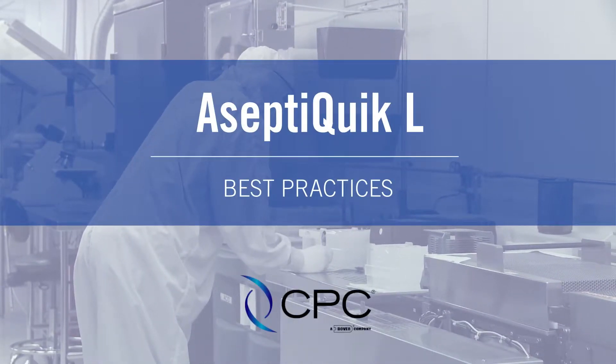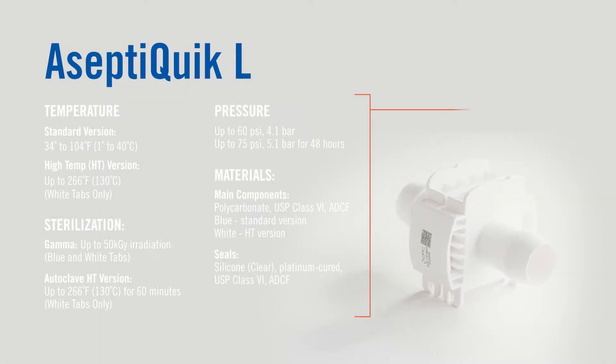Welcome to CPC's AseptiQuik L Best Practices Assembly Recommendations video. Maintaining sterility in your bioprocessing application is critical. Follow these tips to ensure you're using the AseptiQuik L connector correctly.